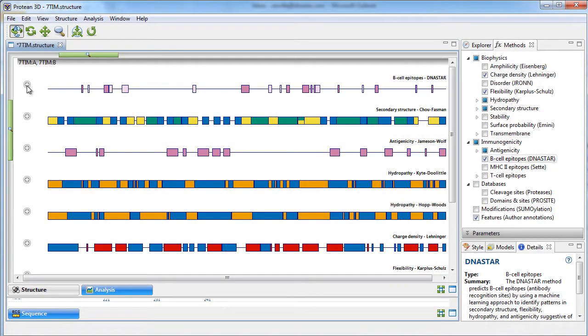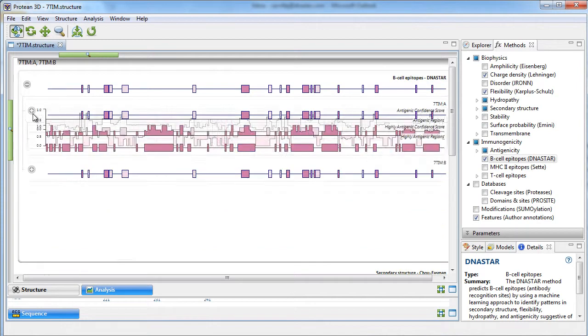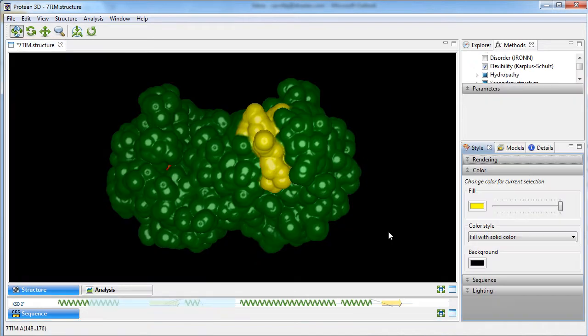Our Structural Biology Suite also has methods to allow you to predict B-cell epitopes. Here you can view confidence scores for the predicted antigenic regions. You can also create molecular and solvent accessible surfaces around your structure and view the predicted epitopes.